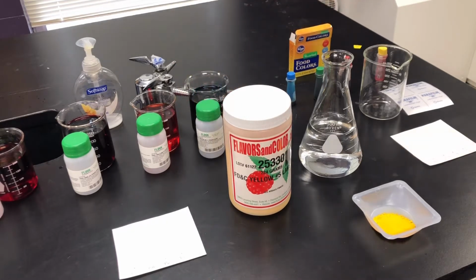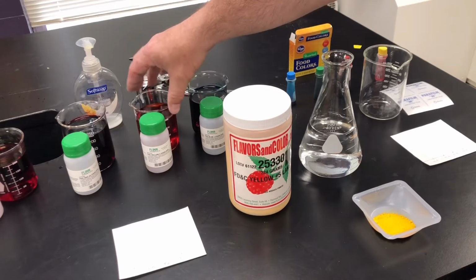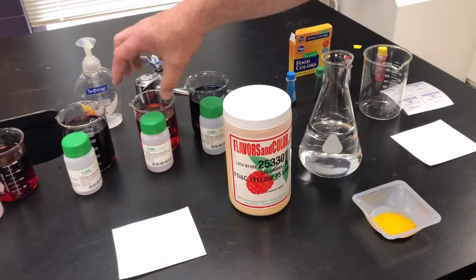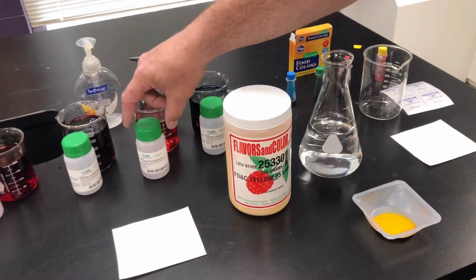If you would, you can go ahead and research how many different FD&C colors there are, and how many of those have been approved for use in our foods and cosmetics. FD&C is food, drug, and cosmetic. What are the different colors and the numbers, and what do they mean? That's kind of neat to understand. And so we have FD&C yellow number 6, and we're going to look at that.